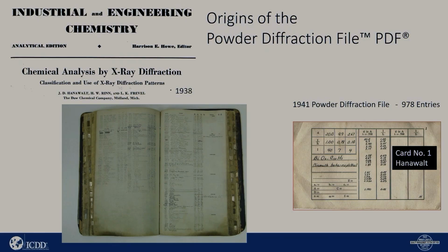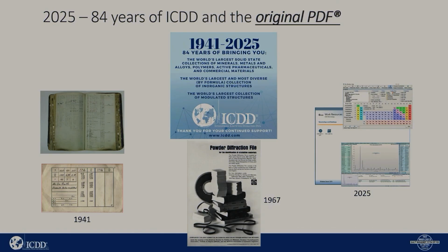You buy basically a case of cards, you'd put it in some kind of a shelf, and conveniently one of your colleagues would pull that card out to take a look at it and not put it back in the same place, and then you could never find it again, okay? So with time, the cards became books, and the books became digital. And so we've made that transition where today everything is in electronic digital format. So we refer to the specific entries as PDF entries, but many people, and even we, when we put the information in our database, will call them cards to this day.